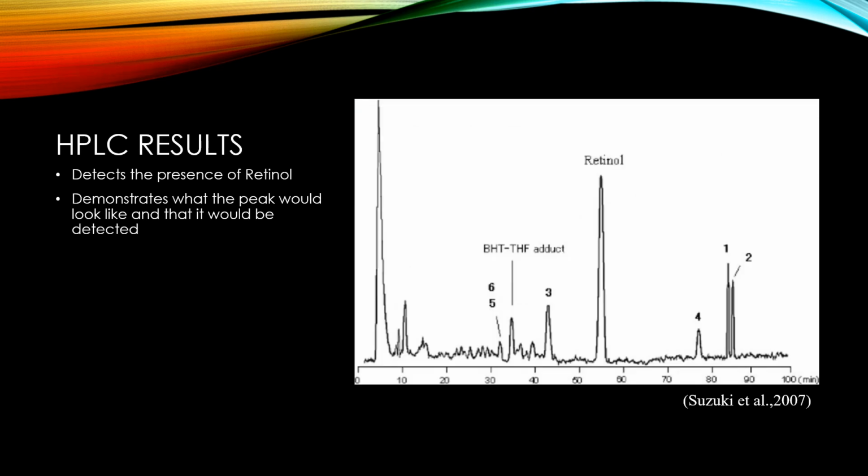So the results that would have been detected, which is the one on the right, is retinol right there. That was the manufactured product that was inside my can. This was given by Dr. Sodoma and I was then told to figure out how we would detect this. So this graph is not one that was made by us. It was taken from the paper, which I cited below.